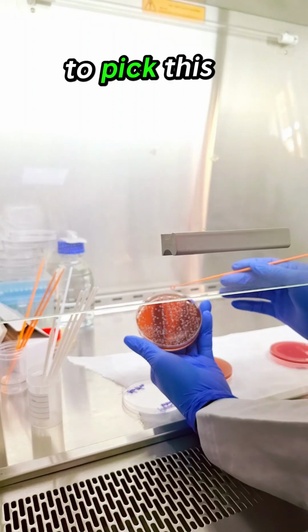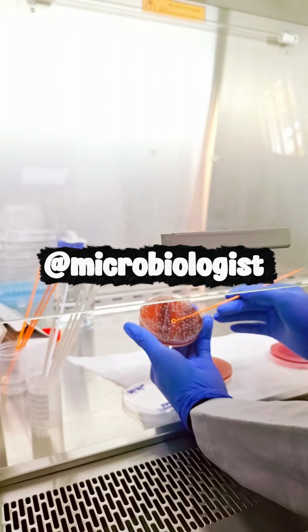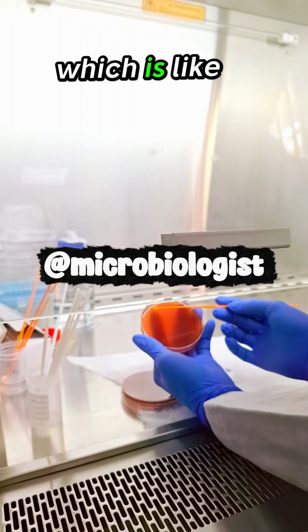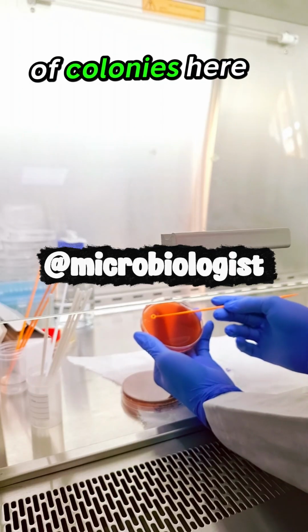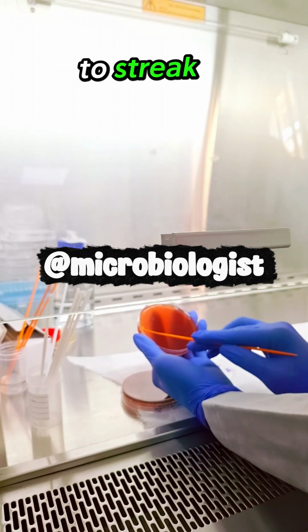So you're going to pick these colonies like this. Just pick general colonies. Of course, they are mixed. I'm just picking random colonies, just like that. So I'm going to make my primary inoculum, like that. Of course, I've picked a lot of colonies here, so you will expect to have a lot of growth. So I'm going to streak.